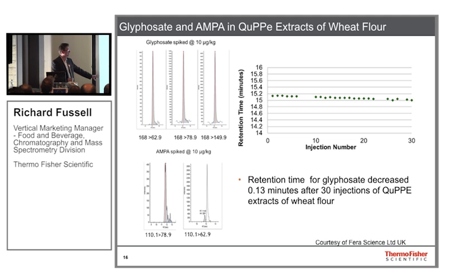And we're actually working on this because we think that one issue with the AMPA is the material that we're using for the suppressor for this system. There are different suppressors. We have another suppressor which has been developed for the environment market, where they specifically want to analyze glyphosate and AMPA in surface waters, and it gives much better peak shape. So we've got a prototype suppressor which has been made, so it's higher pressure with this material, to see whether we can get the better peak shape for the AMPA and to make sure it doesn't affect any of the peak shapes for the other compounds.